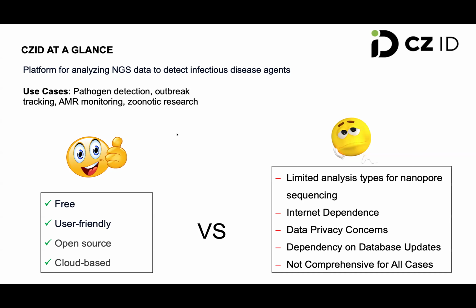If you don't have any bioinformatics background, this is the one that is easy to use because it has a lot of default settings, a lot of filters which you don't have to change because they're set by default, and they make sure that the quality of your DNA is good enough to get good results.